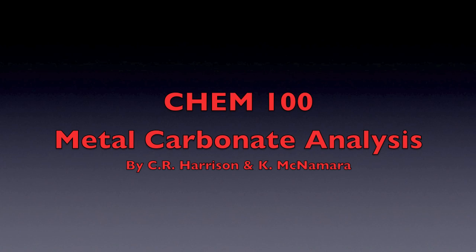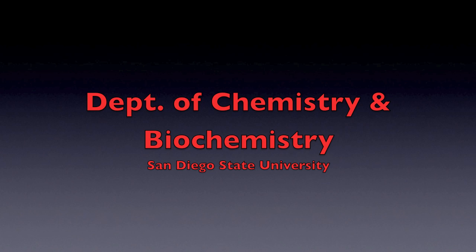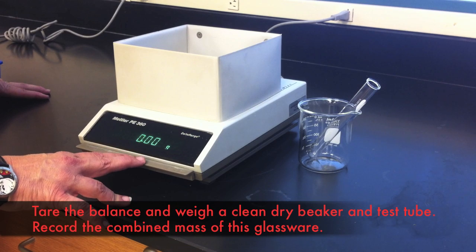In this lab you'll be looking at the evolution of carbon dioxide gas from metal carbonate solids. This will be done by measuring the mass of the solid before and after reaction with a strong acid.